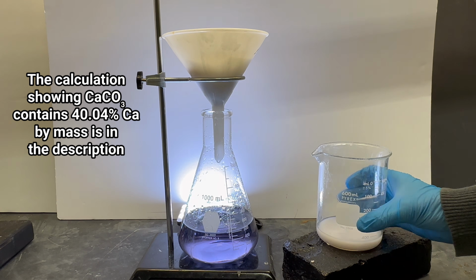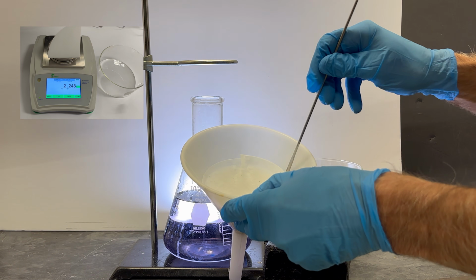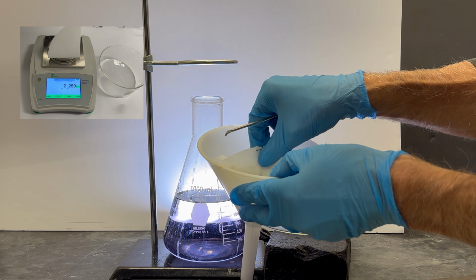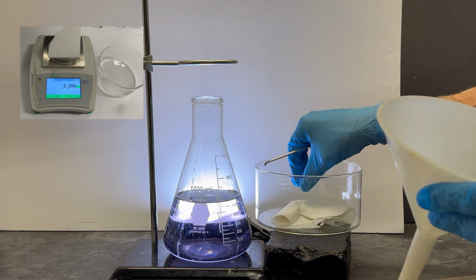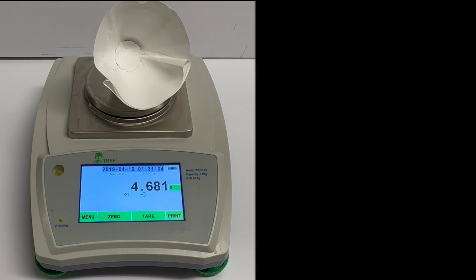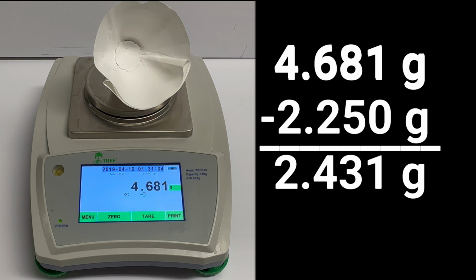All right, now that I've transferred the solid to filter paper, which I pre-weighed at 2.250 grams by the way, I need to collect the solid and pop it in an oven at just over 100 Celsius until dry. Come on, baby, it's the moment of truth. The mass of filter paper plus calcium carbonate is 4.681 grams. Subtracting the mass of the filter paper, this comes out to 2.431 grams of calcium carbonate.